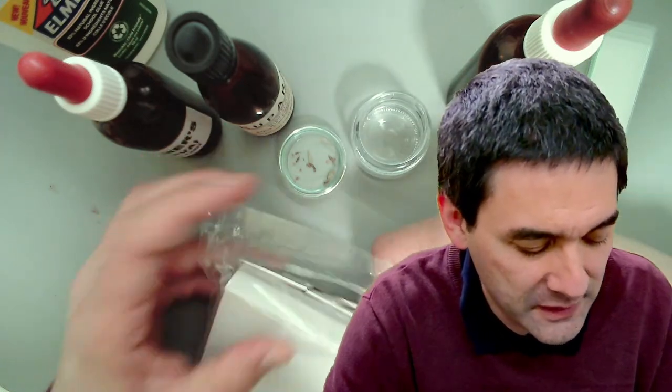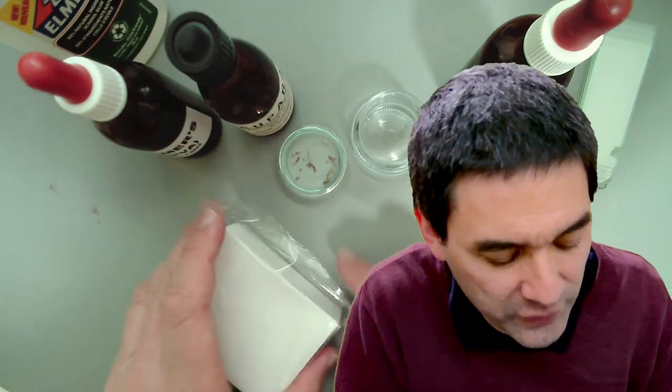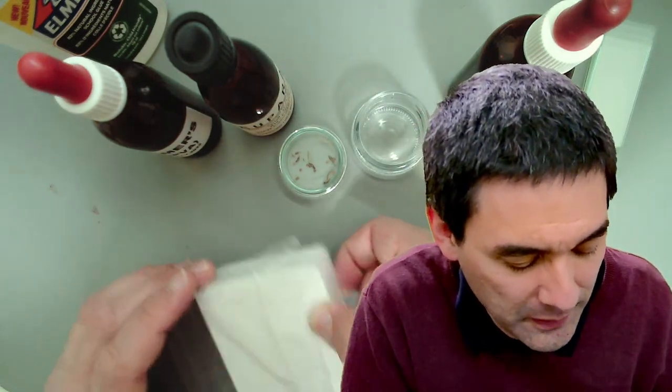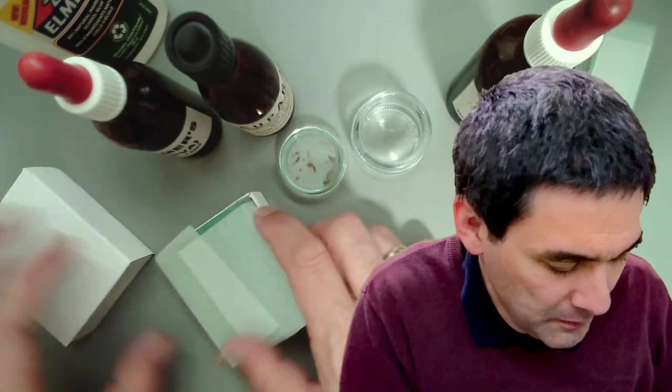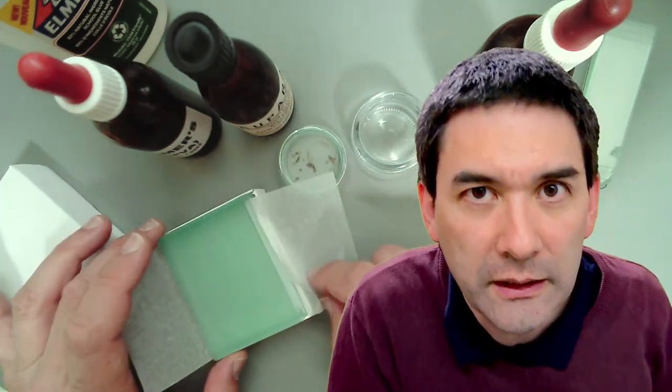I wanted to mount a couple of slides, and then I basically decided I'm simply going to collect some of those varroa mites and put them on the slide. Yeah, I'm opening now a new slide box, so I do not have to dry wipe them. I like those here because they are really clean.